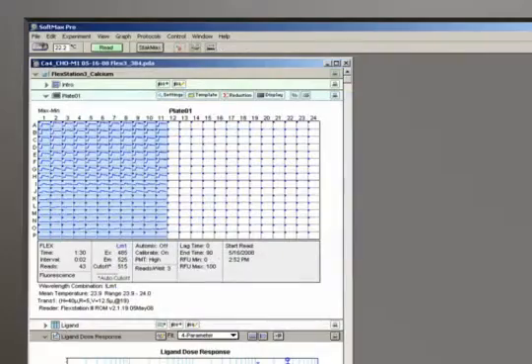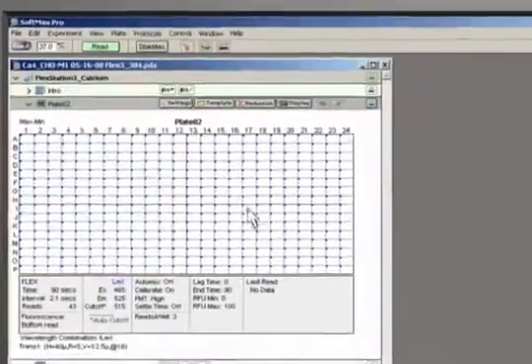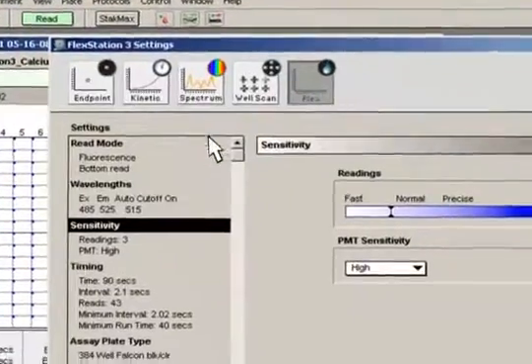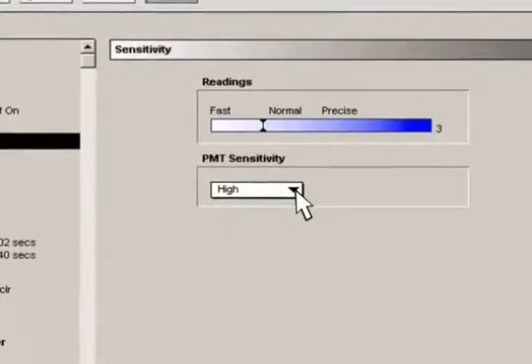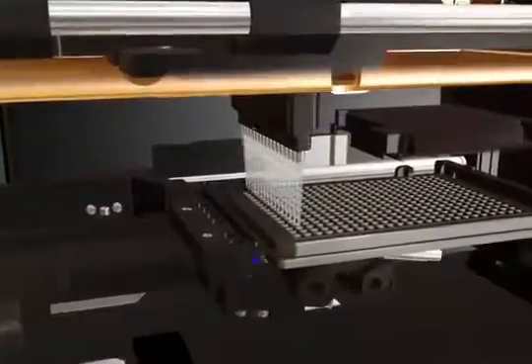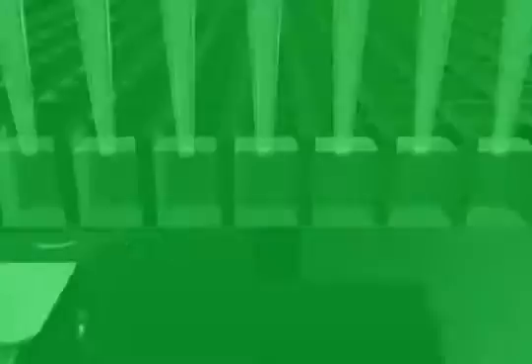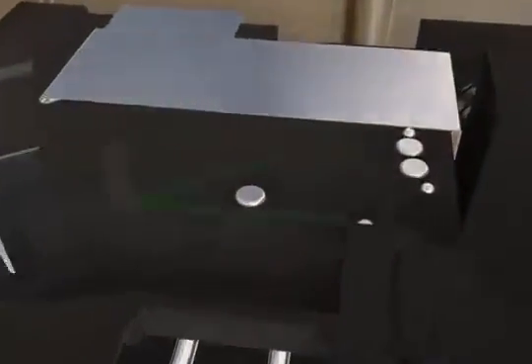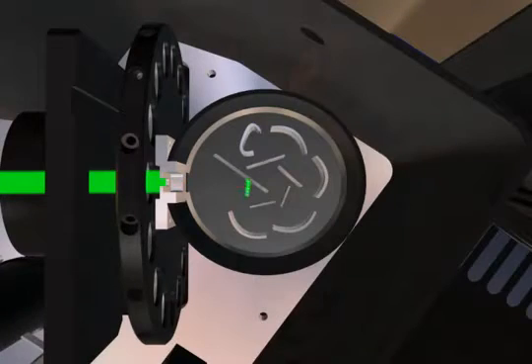The FlexStation 3 reader offers a range of sensitivity settings. In cases of high fluorophore concentration, the high PMT setting can lead to saturation. This occurs when the gain of the PMT is too high, leading to over-amplification of the original signal.